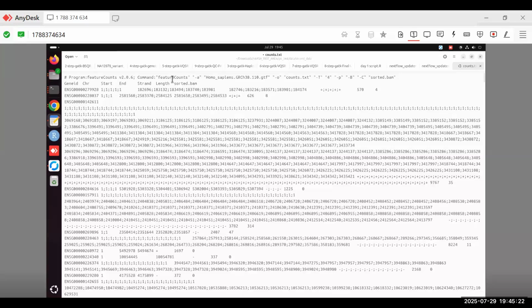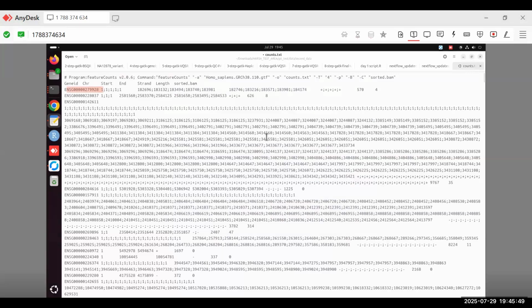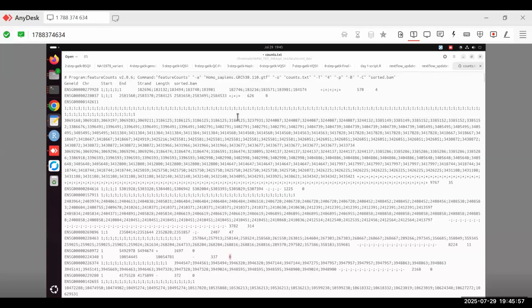You can see there are different metadata informations available in your count matrix. These are all your Ensembl IDs, ENSG. Just ignore this for now. On the left-hand side, you have these Ensembl IDs here. You have the coordinates, and then you have certain values which are talking about the expression values here. So this is what your count file will be. In symbol IDs, different values on which strand it is present, and then what is going to be the expression value it is. Right?